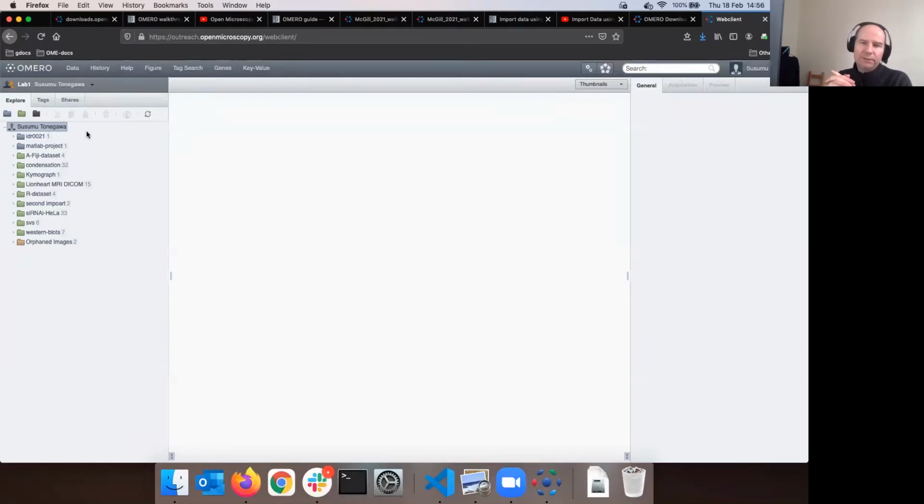That would be quite typical, or C. Brown. Okay, that would be another typical. So the first initial of your first name, and then you would have your full family name attached to that without any space. And that would be something which you would maybe obtain from your institution, because OMERO can synchronize with the institutional login system.